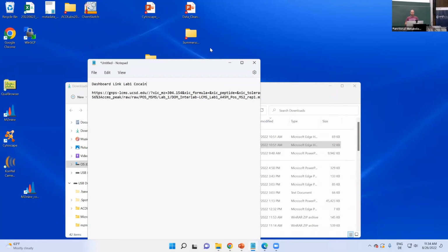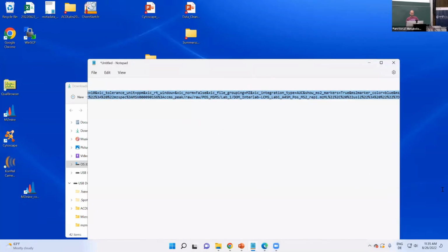All right, let's get started again. I was just checking the chat, and there were actually a couple of good questions. Maybe before we continue with Cytoscape, I want to jump back to the dashboard and show you that quickly. The question was about whether we can overlay different files. That was a little bit what I indicated with the USI1, USI2 thing. So I want to go back and also showcase how that URL here might be useful.